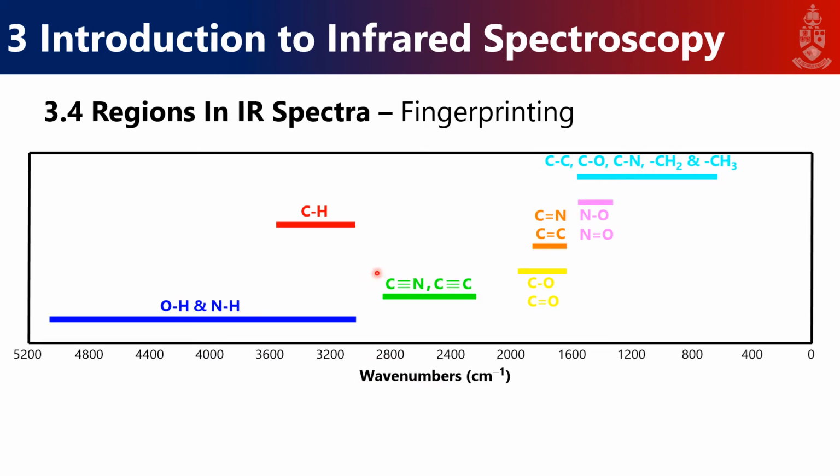So getting to the point of what are we looking for, you will see this figure in your Prac guide. So this gives you a list of where we expect specific kinds of stretches, or the region. So where do we expect the bond of carbon and nitrogen, or oxygen and hydrogen, or nitrogen and oxygen, specifically the carbonyl group, for example. What else do we have? We have NHs, a lot of NHs in these molecules that we look at. So where do we expect those stretches to be?